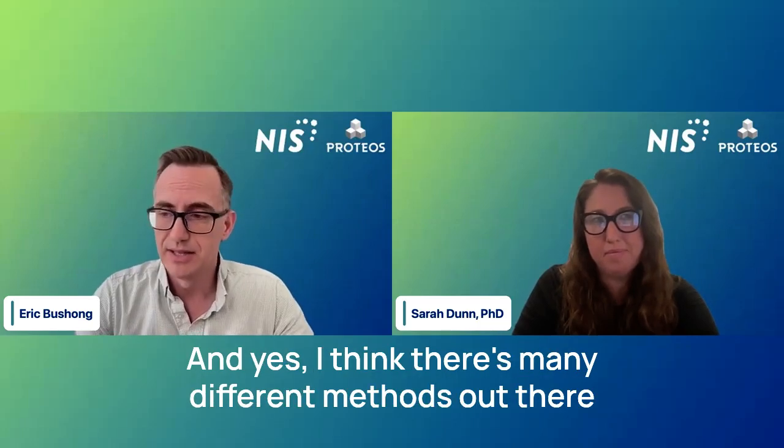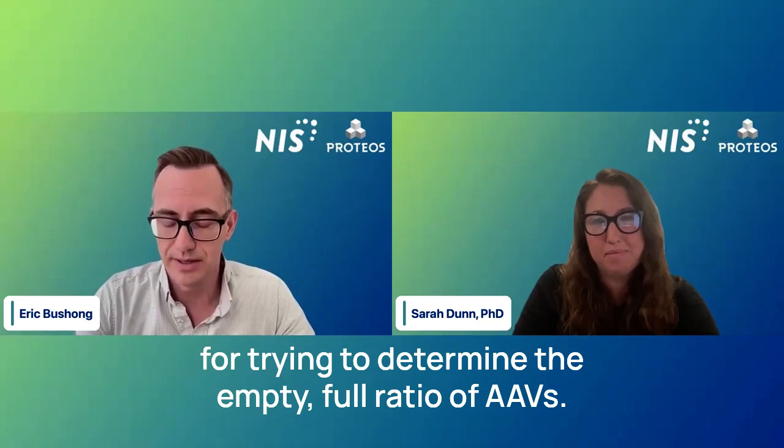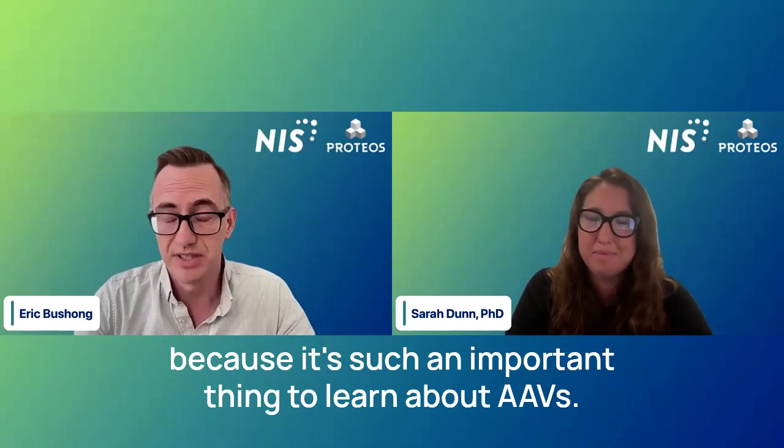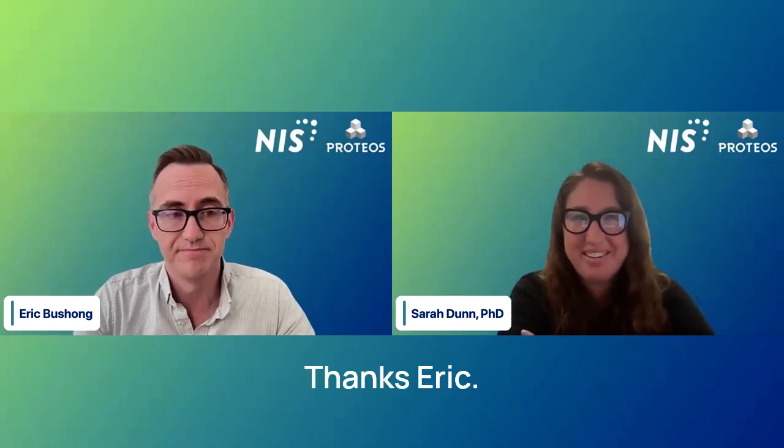And yes, I think there are many different methods out there for trying to determine the empty-full ratio of AAVs. The reason people have tried so many ways is because it's such an important thing to learn about AAVs. Thanks, Eric.